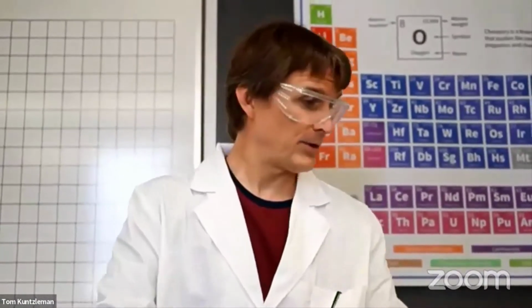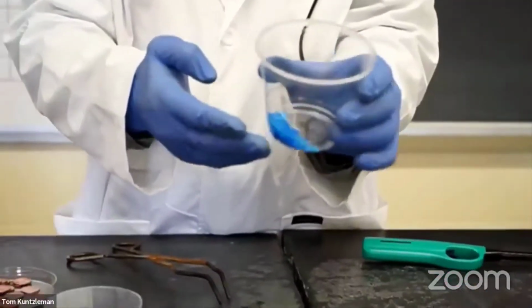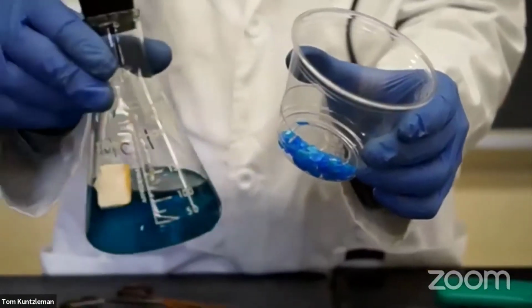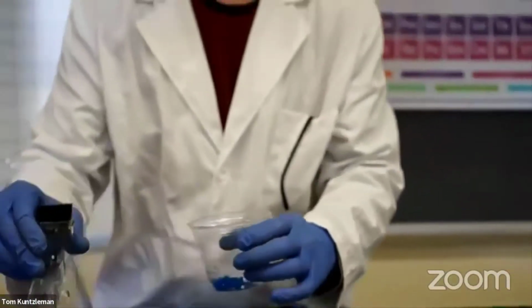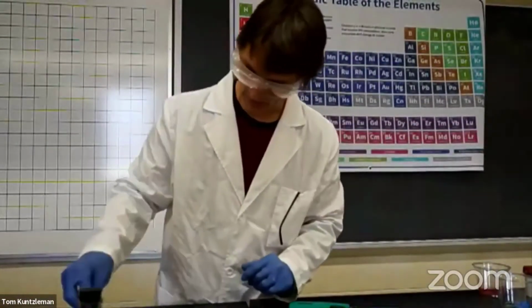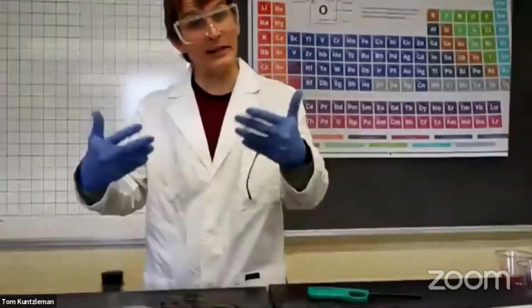Do you remember? I mentioned earlier that when copper ions are in the +2 form, they're blue. And so I took a salt that's similar to this one that contains copper ions, and I dissolved it in some water to make the solution. You know what we're going to try and do? We're going to try to get the copper to come out of this solution as a metal. That's right. We're going to try to do it as a metal. Well, how are we going to do that? Well, to do that, I'm going to add a metal to the solution that's more reactive than copper.